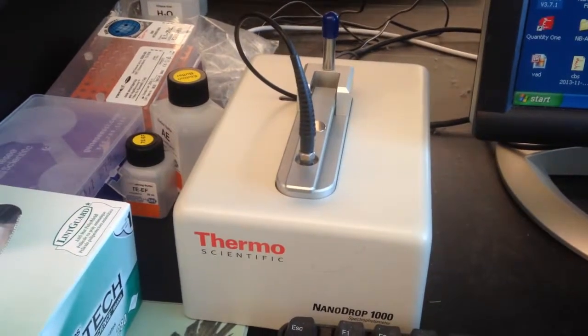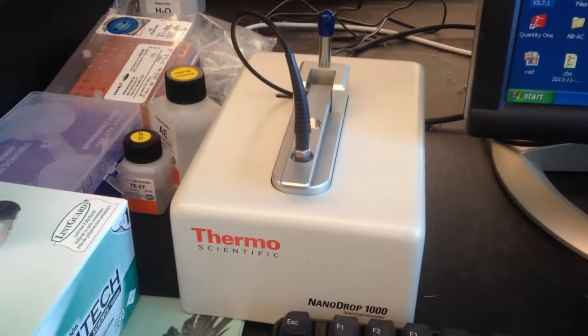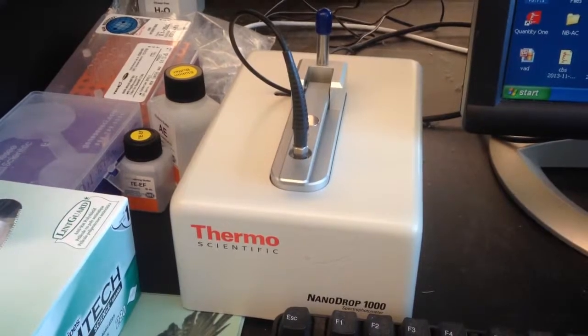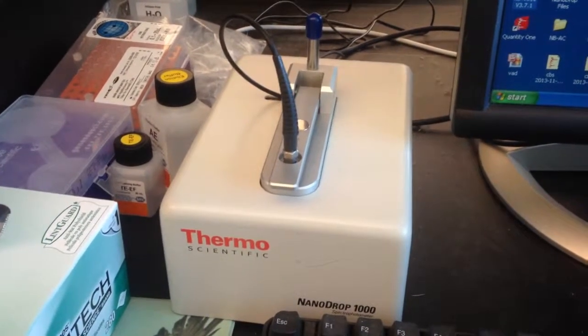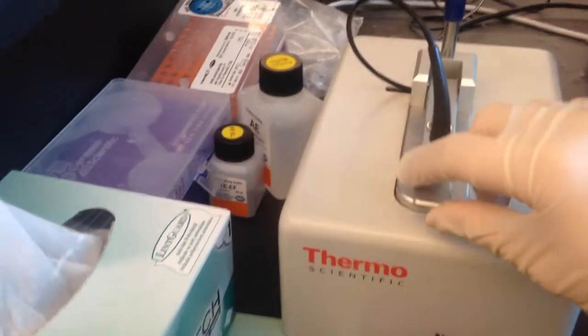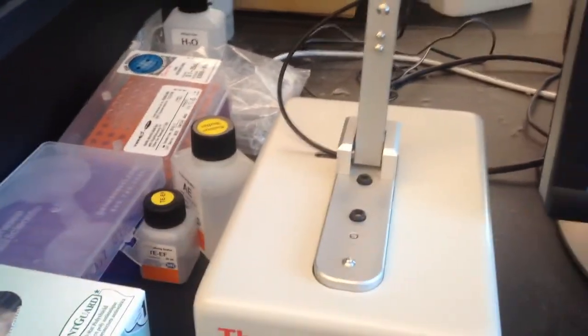Now we are going to move on to the nanodrop. So this is what a typical nanodrop machine looks like. It's obviously nothing fancy, but it's a beautiful machine.